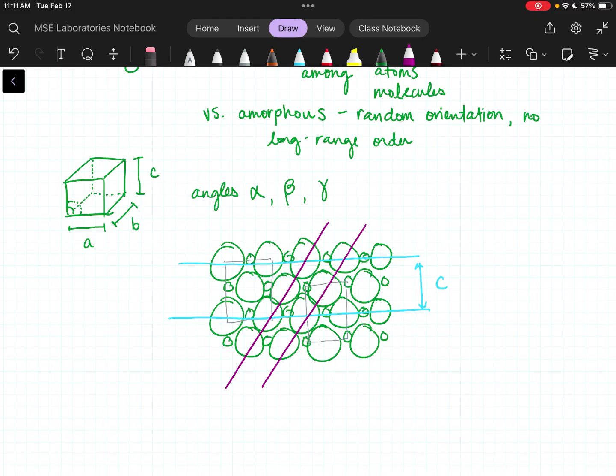Now, let's take another line. This one that was sideways. Could you, if you had to, use geometry to figure out that distance in terms of A or B or C? Yeah, you could do it, right? What we do, instead of trying to identify every single one, we call all of them D. A D spacing is a space between two identical planes.